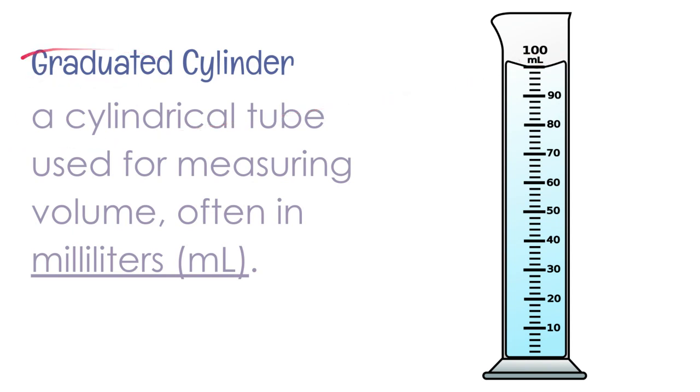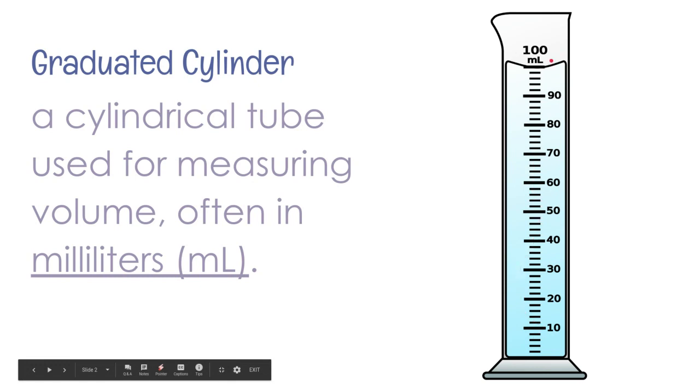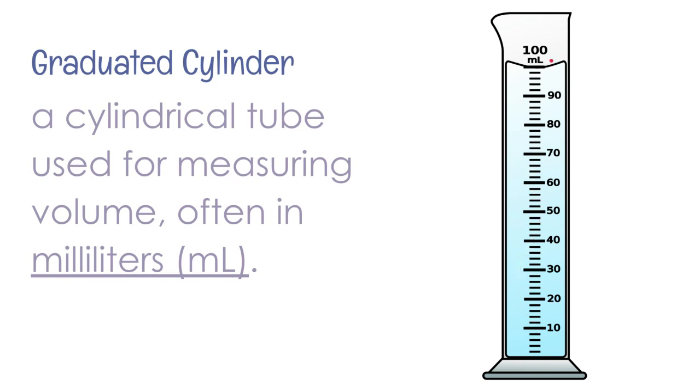Now, what does graduated mean? It just means that they put all of these measurements on it. They broke it up into smaller pieces. That's what graduated is. It does not mean that it graduated from high school. It means that we have little measurements all over it. And it's in the shape of a cylinder. Surprise.